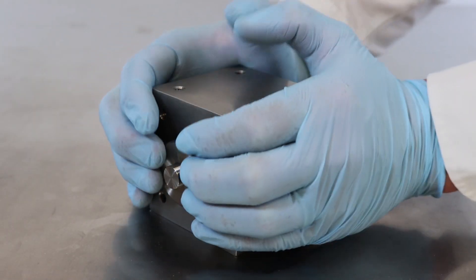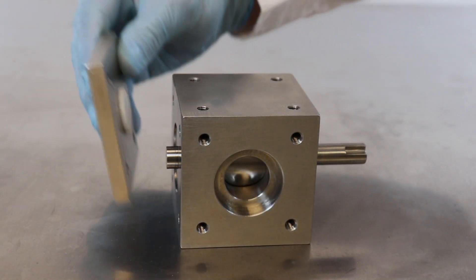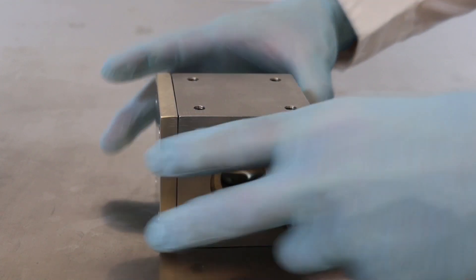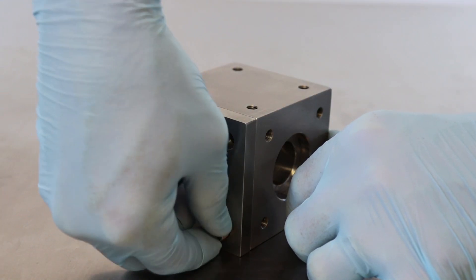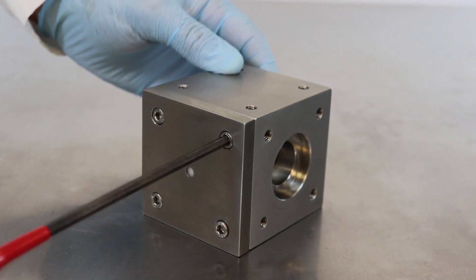Push the piston in the opposite direction to make it flush to the block assembly. One of the end plates has a bushing without a through hole. The recess of the bushing will fit over the short end of the rotary piston. Insert four 1/2-inch, 1/4-20 stainless steel bolts and use a 3/16-inch Allen wrench to tighten them snug.